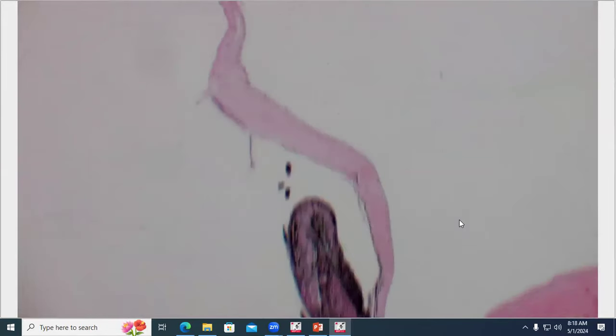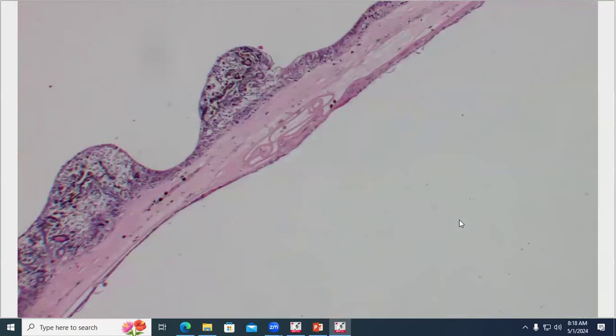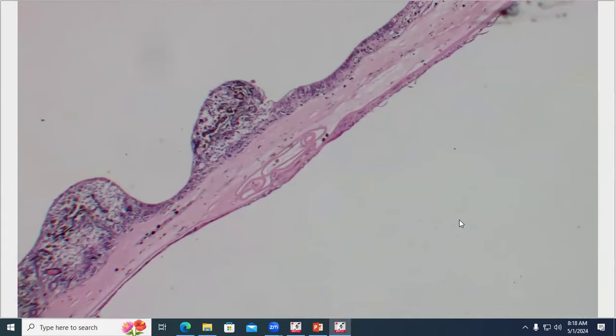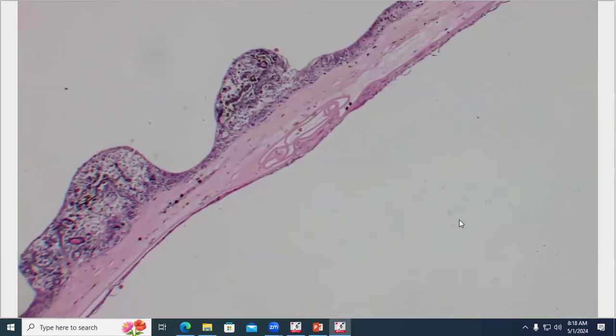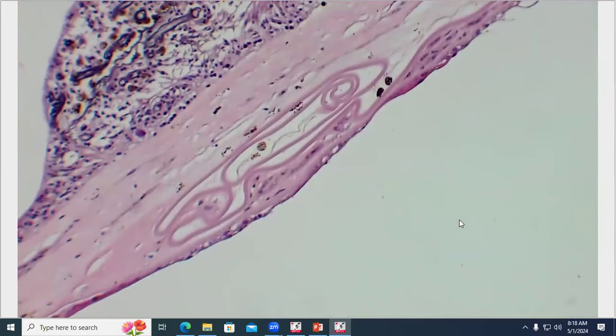The lens capsule ruptured. Imagine like a porcupine quill, lens capsule, or lens fiber lollipop sort of quill inside the lens. Yes, or perhaps a cake pop. Right. So here is one end of the ruptured posterior lens capsule. Yes, indeed, the lens capsule has ruptured.